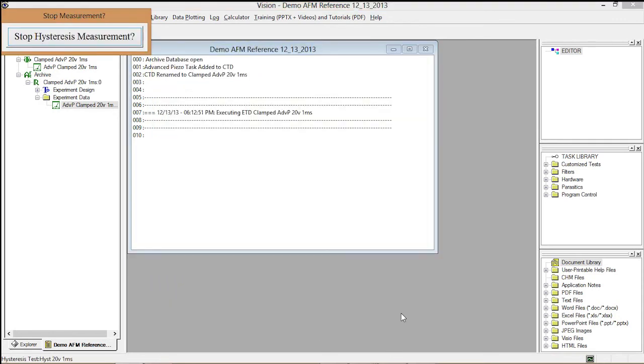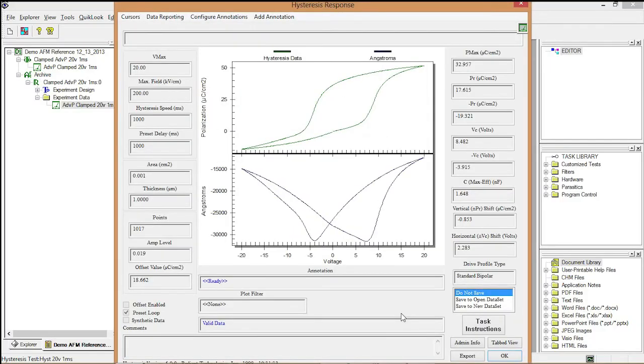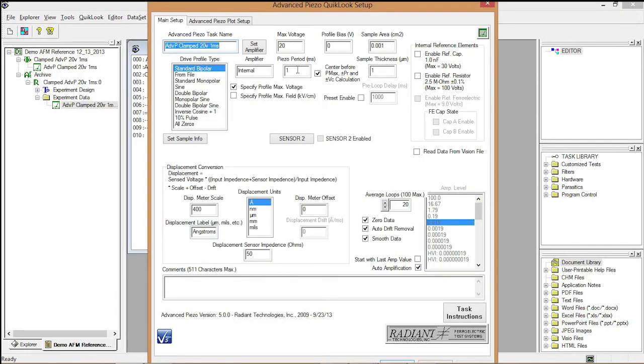I repeat the quick look hysteresis test. Now the membrane is visibly moving and we get a very large butterfly loop — showing approximately minus 15,000 to minus 30,000 angstroms, which is approximately 1.5 to 2 microns of total motion. I discard that data and return to Advanced Piezo for the proper measurement.